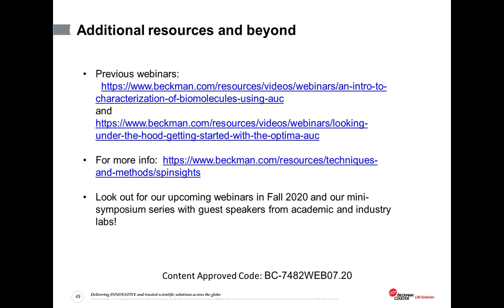Absolutely. As a follow-up to what you just mentioned with the Joshi paper, someone is asking for a little bit more detail on what a fed batch process looks like. Okay, so when we send out our follow-up email, we'll send a link to that paper. I believe it is freely available for download. So you'll find all of the details that you need about density at the point of infection, exactly what kind of nutrients were put in, and what kind of process monitoring system was available. We'll just send you the link to the paper.